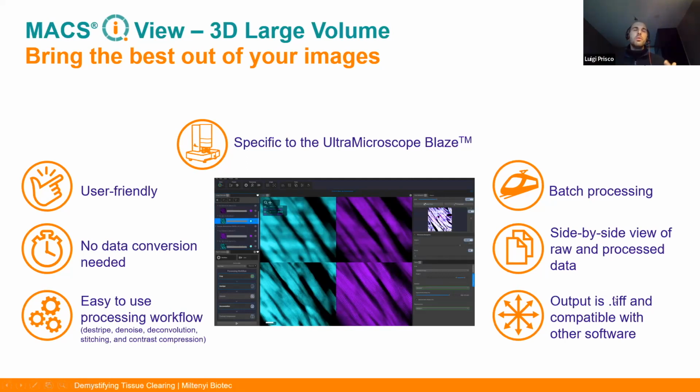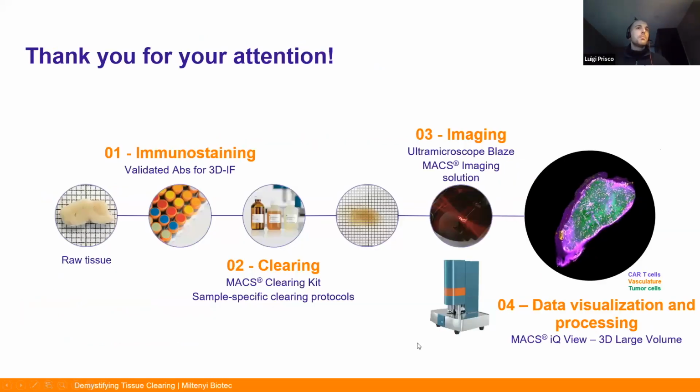When it comes to output, you have a couple of options, but the standard would be a TIFF file, so no crazy formats there. You would be able to feed these data to any further software that you like.